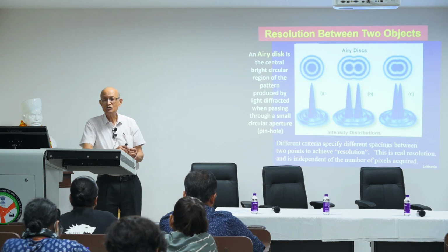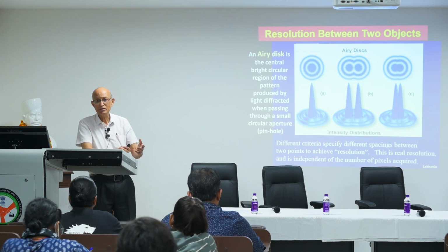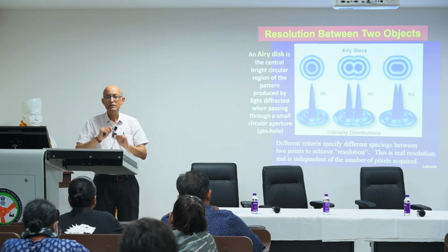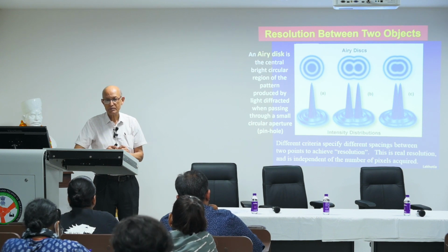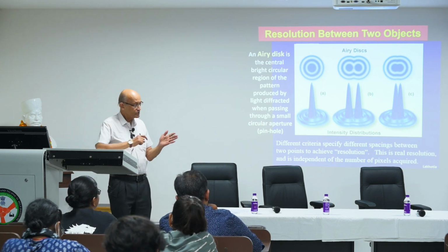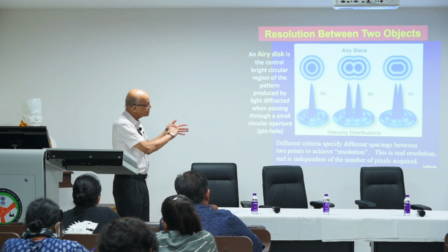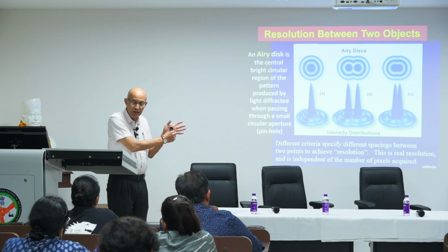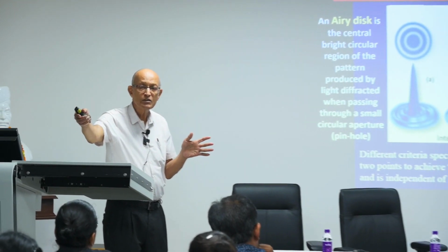Yes, you need to use antibodies tagged with fluorochromes which have non-overlapping, or minimally overlapping, excitation and emission. Because the excitation spectrum is like this, even if they overlap, the energy is so low that it may not excite the other fluorochrome, because it needs a certain minimal amount of energy.